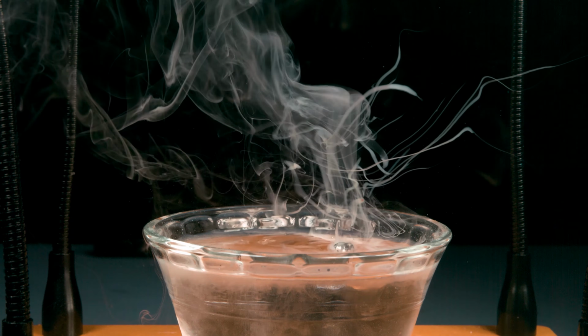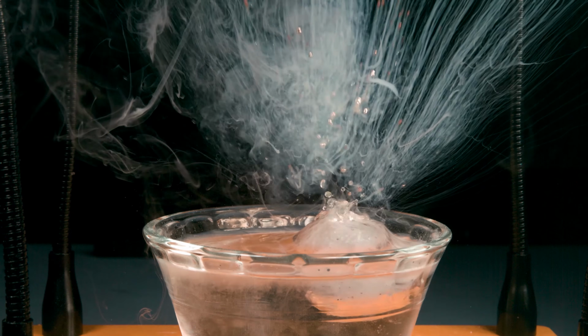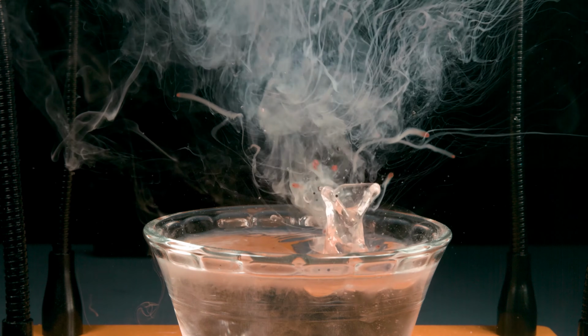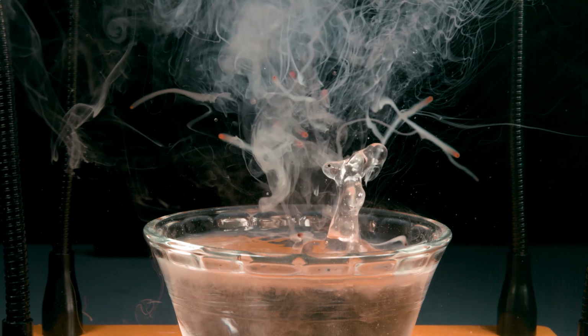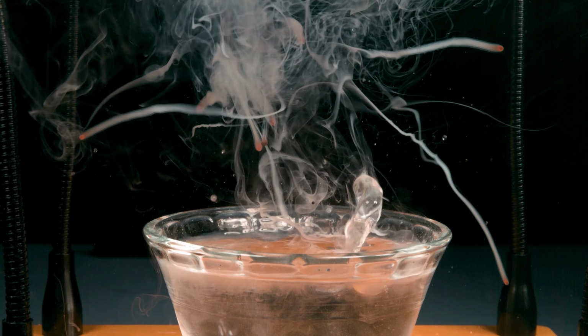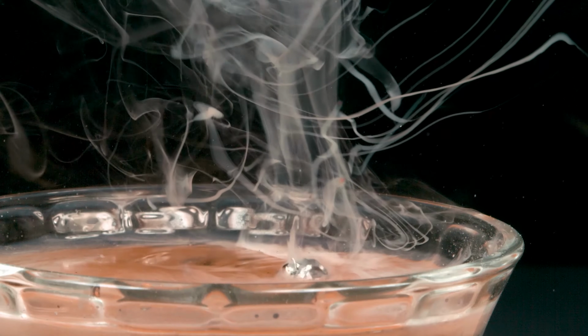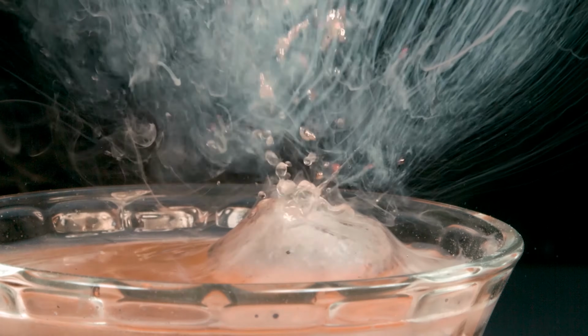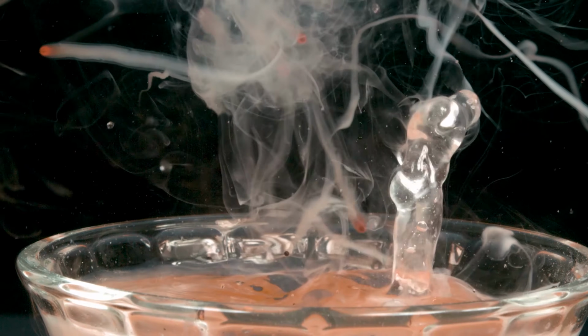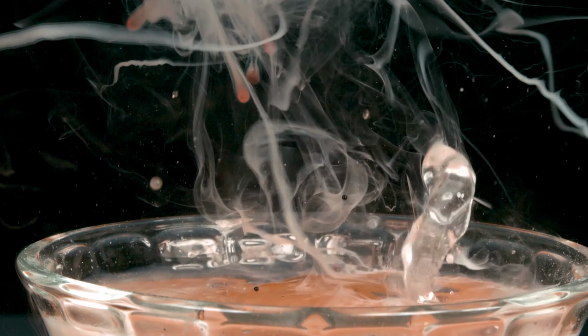Here's potassium in a shallow beaker with the explosion, and there's almost like a secondary explosion afterwards that has more molten material. I think I'm going to push in and zoom in a little bit tighter in that second shot so we can see it better. What I love about this is you can kind of see two explosions. There's the first one, then there's a bubble that ignites and then forces the second explosion up with even more molten material. And you can see these fragments flying with that pale violet flame.